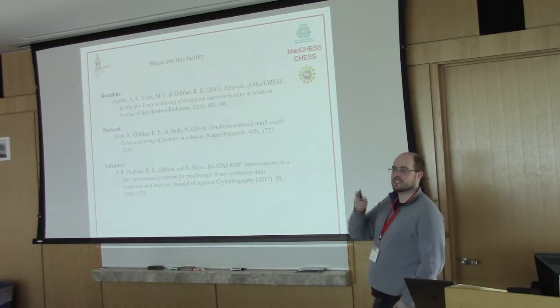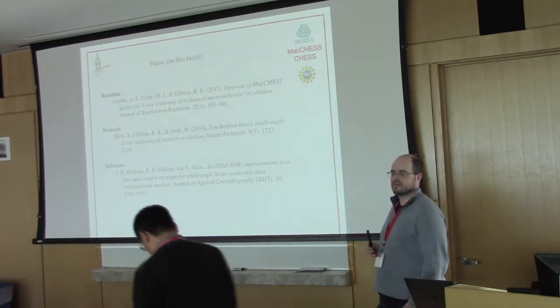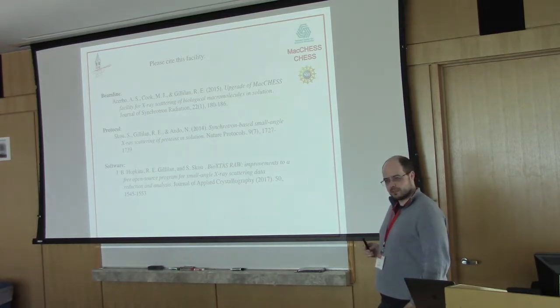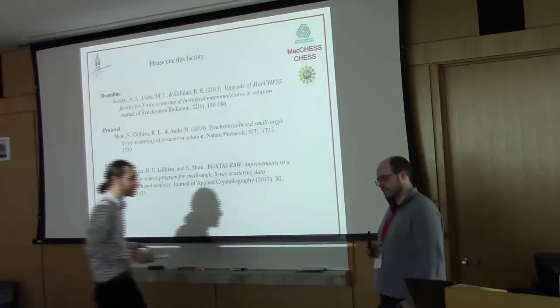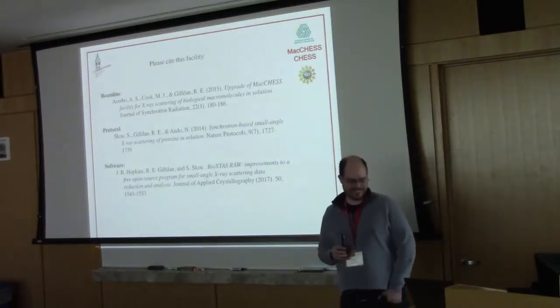Yes. I was just going to ask, do you know if the recent paper about the new guidelines includes resolution for bead? Because I didn't really talk about that. Maybe I should add it. It's been a little while since I really thoroughly went through that paper, so I'm not sure. I think they recommend including it in the resolution estimates, but I'm not sure anyone really agreed on exactly how that should work.